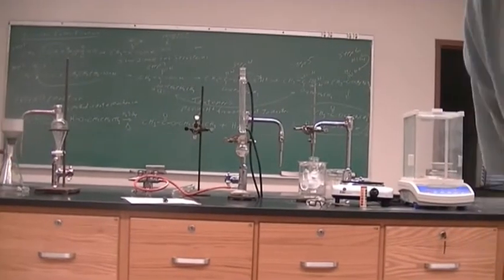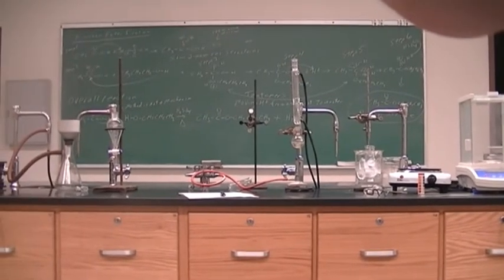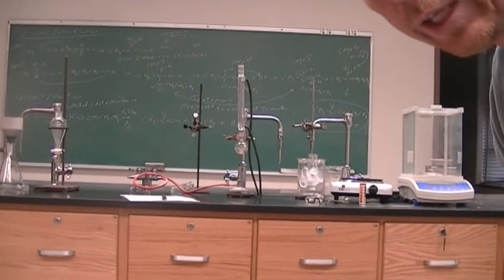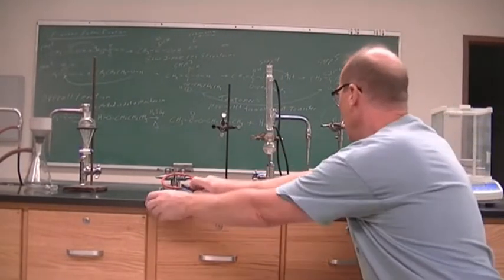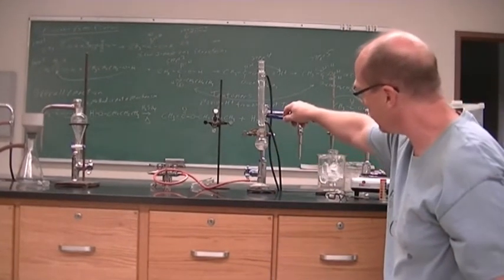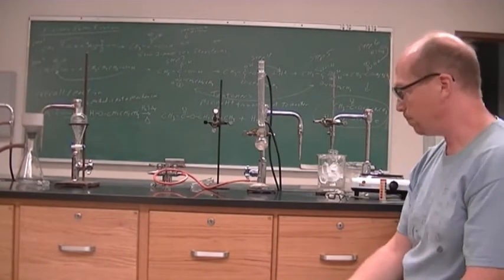All right, so we're ready to start our experiment. And you will be happy to know that in step 1 it says to reflux for an hour. Well, the reflux has been going for an hour, so we're not going to watch this thing on the video boil and condense. So here is our reaction right here. Not very exciting. It's a clear colorless solution, the solvent front is going to here, and then it's dripping back down. We have a boiling chip in the bottom.